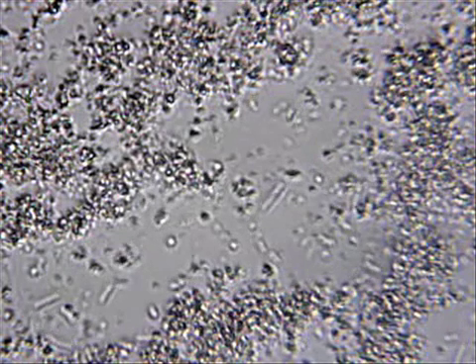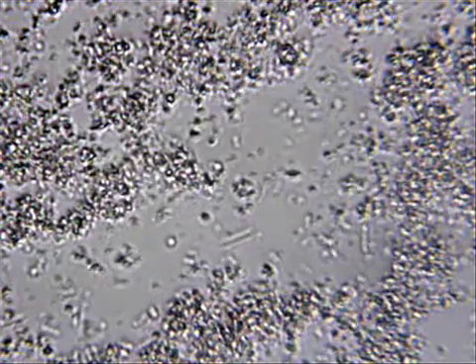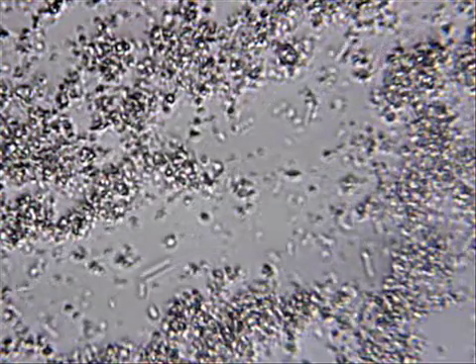Hello boys and girls, you're about to see videos shot under the microscope of goat yogurt. This is a yogurt I made at home. I use the Yo Gourmet starter, their acidophilus starter — it's really tangy, it's my favorite.